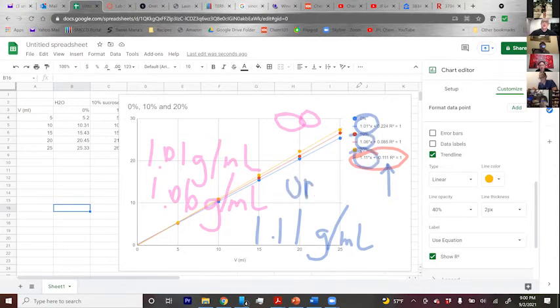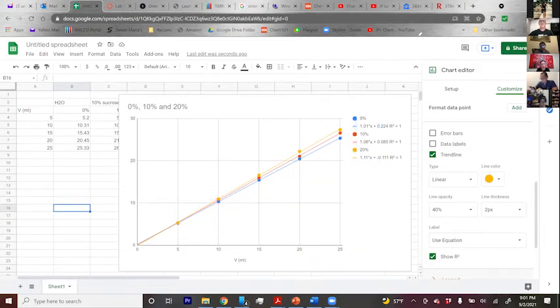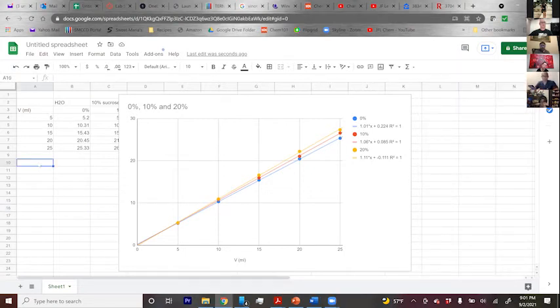So let's deal with that, because what these slopes are, this one, and this one, we're going to call uncorrected. These are uncorrected because we haven't corrected for a y-intercept of 0. So if you remember, hopefully some people will remember from last week, how do we deal with that? We dealt with it by using a function in the spreadsheet called linear estimate. Remember that?